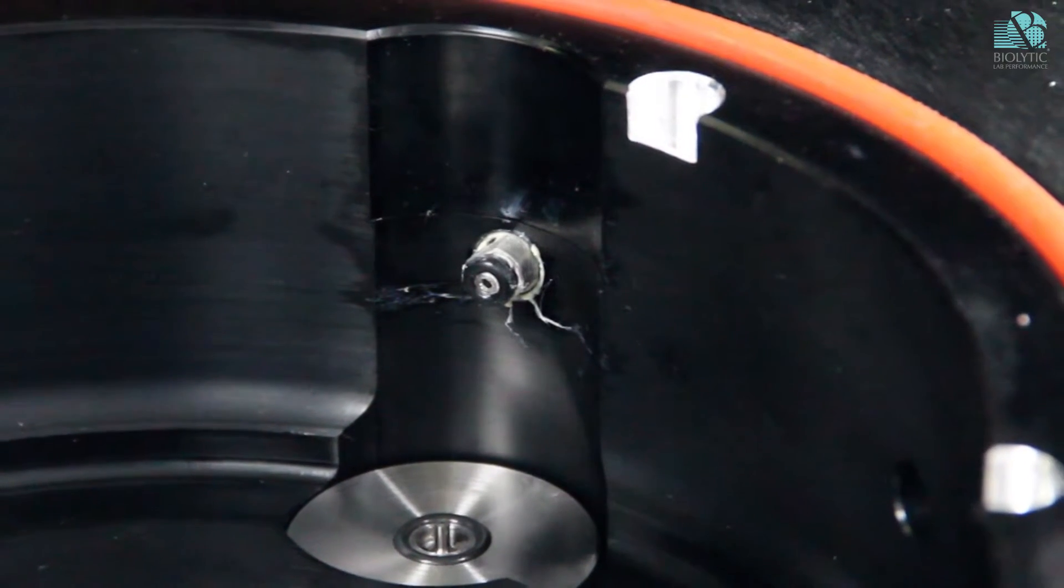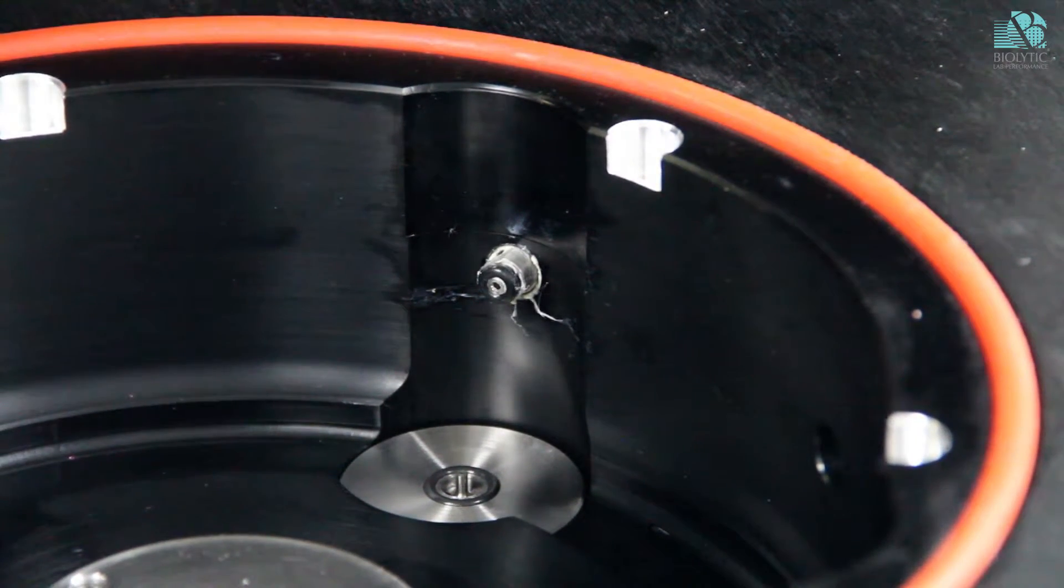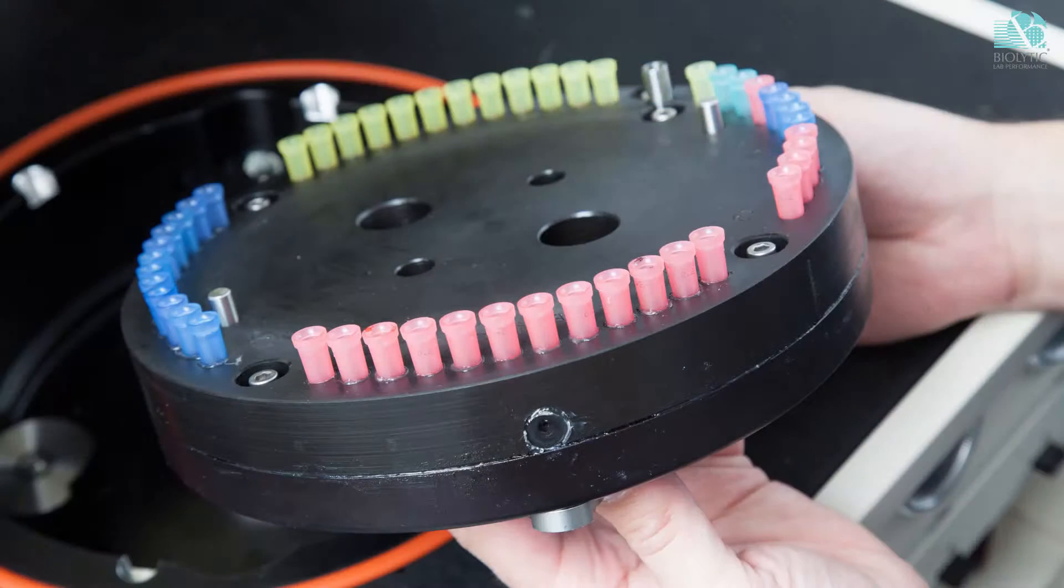There's four of them now and they engage with the rotor and allow us to do a very slow drain. Each bank has the ability to do three different slow drain levels and they can do them at different rates and at different times from each other. So they're completely independent from each other.